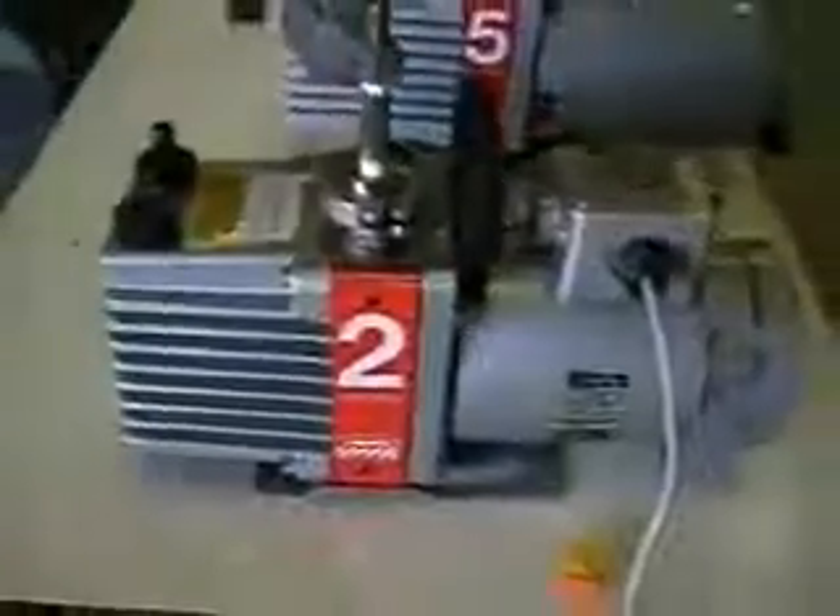This particular unit has a flow rate of 2 CFM, 115 volts. It's your oil fill, exhaust, gas ballast. And the unit only comes with the fitting here on top. We do not have any other in-house.